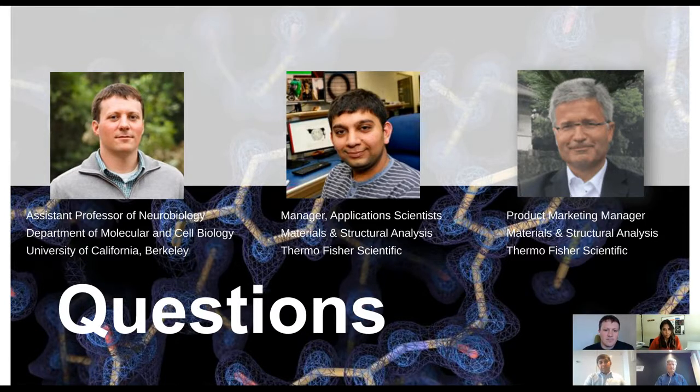In case of GABA receptor now, where there is a lower symmetry, some more flexibility, some more challenges, there the difference starts to become slightly bigger. On the Glacios with Selectris, we get 2.4 angstrom. On Krios with a bottom-mounted Falcon 4, we get to 2 angstroms. And Krios with Selectris and Falcon 4, we push it to 1.7 angstroms in case of a symmetric form of GABA.